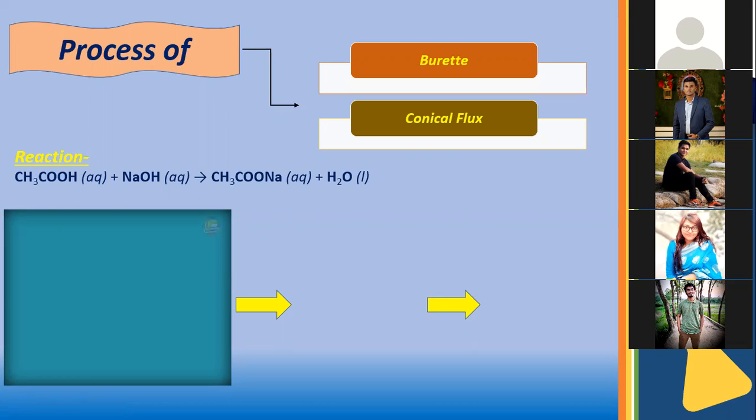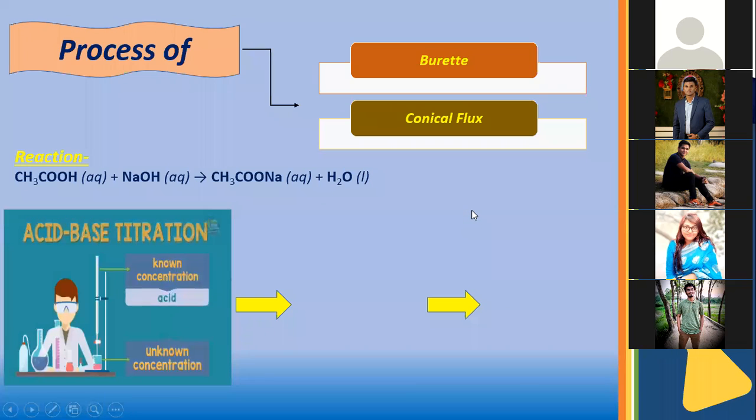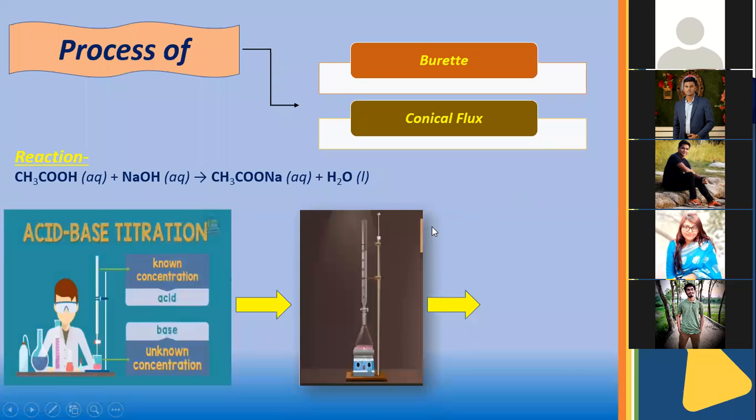Basically, in this segment, I'm going to discuss the titration procedure. My previous group members discussed all the constructional parts, and Mr. Rafiul Islam discussed the preparation of acetic acid, and we have prepared an acetic acid solution. Now, as you can see in the slide, we have taken the prepared acetic acid in a burette from the volumetric flask, and in a conical flask, taken sodium hydroxide and also the indicator. When we rotate the burette knob, the acid falls dropwise into the conical flask.